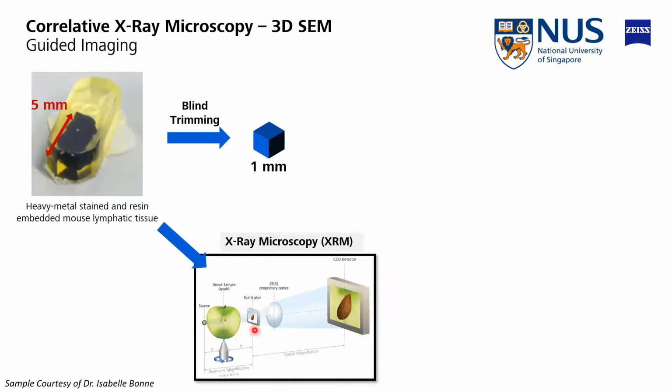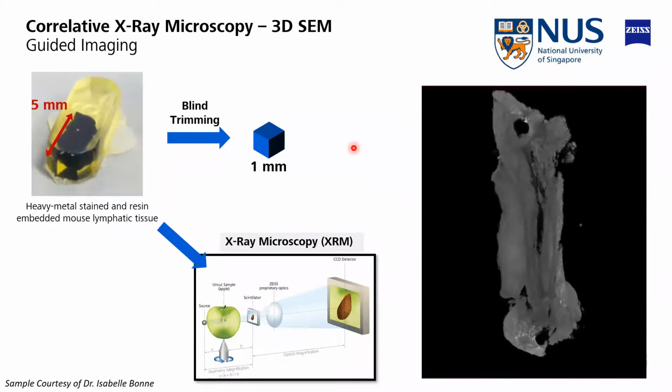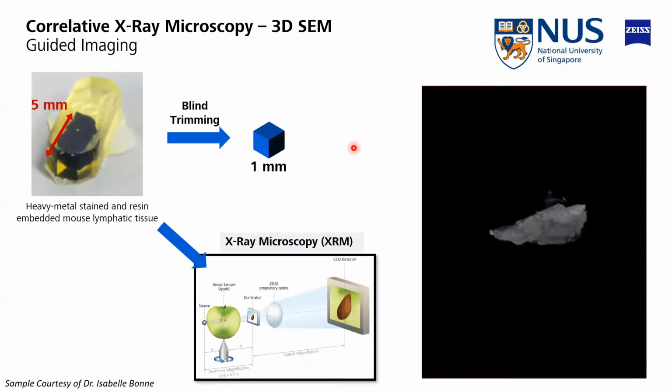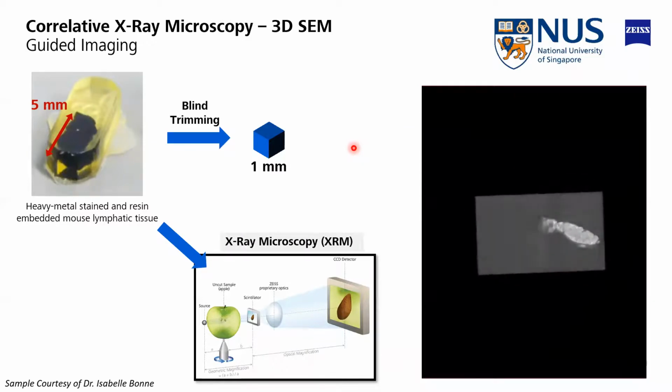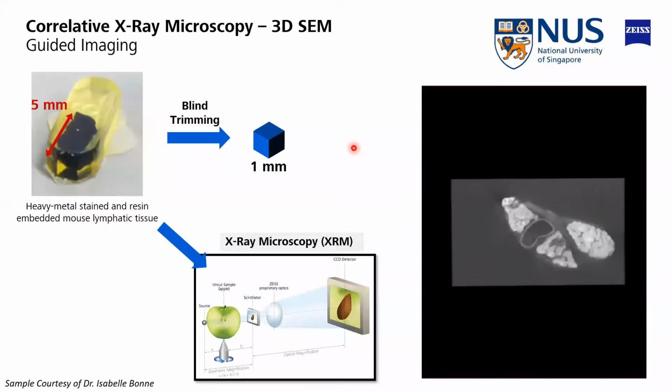We rotate the sample, and at each of those rotation steps, we take another image, and this we can combine into a three-dimensional data set. What you need to take away here is that we don't destroy the sample in that process. So that allows us to do something like this. Again, a 5 millimeter sample, and then we can view that three-dimensionally from the surface, and then we can cross-section the sample and run through and preview what is actually inside that tissue.